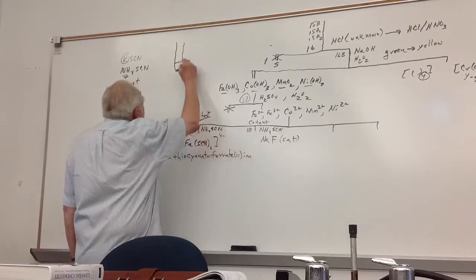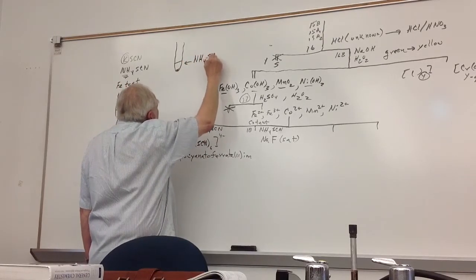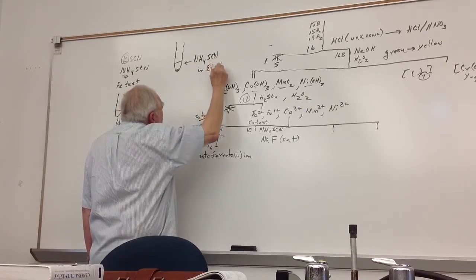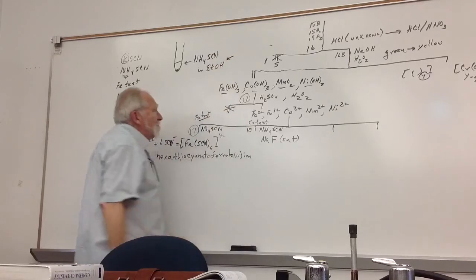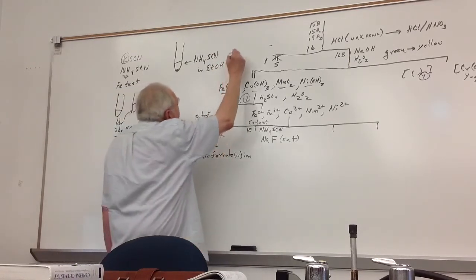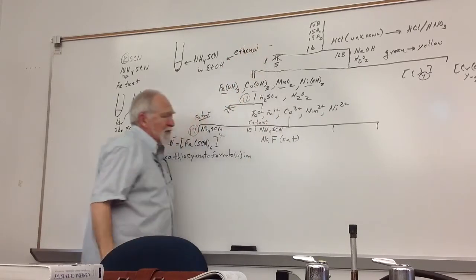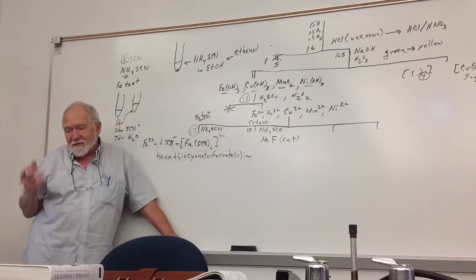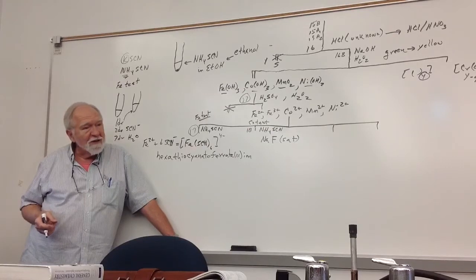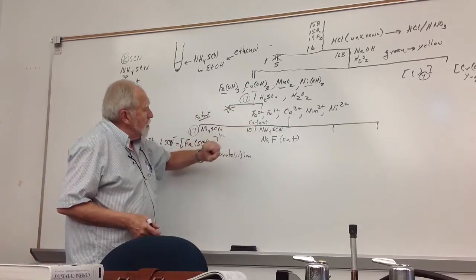And then you want to add ethanol. This is the old-fashioned way of abbreviating ethanol. Ethyl alcohol is the common name, and that's where the EtOH came from. Ethyl, and then the OH for the alcohol. Now, the alcohol stabilizes the complex you get with cobalt.